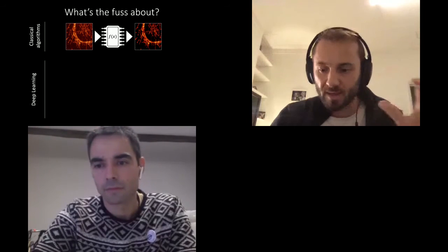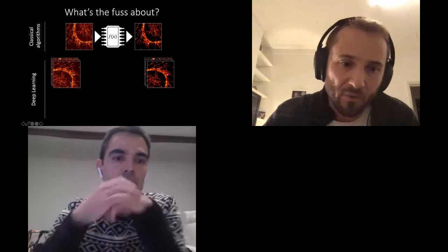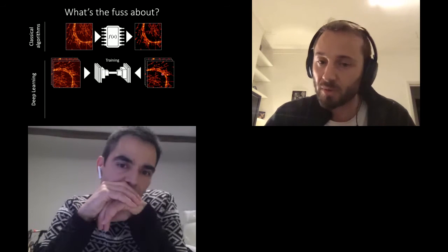In the case of deep learning, the concept actually turns all of this idea on its head, because it starts from the data, right? By first generating and obtaining data of what we want as input and what we want as equivalent output, we can feed this into a neural network and tell it, here you go, you're going to have to learn how to go from input A to B, from the output. And now you can work it out.